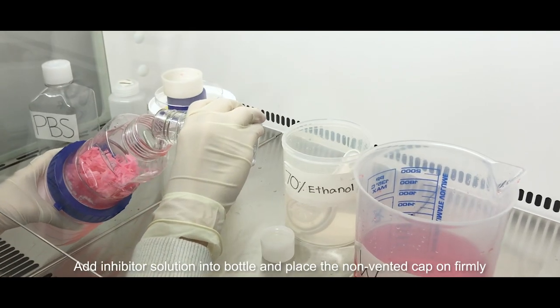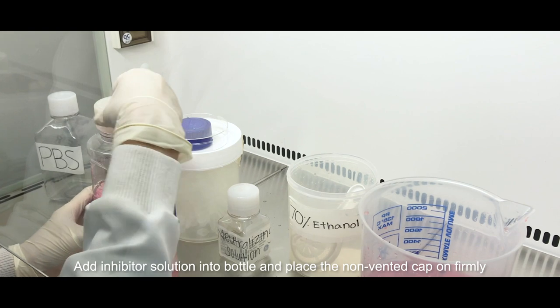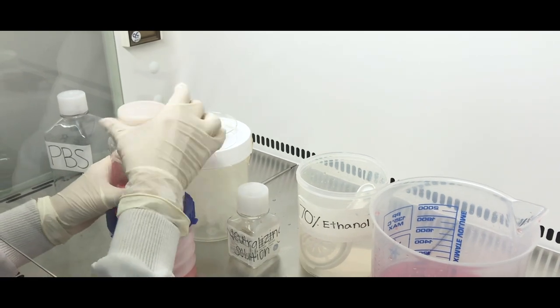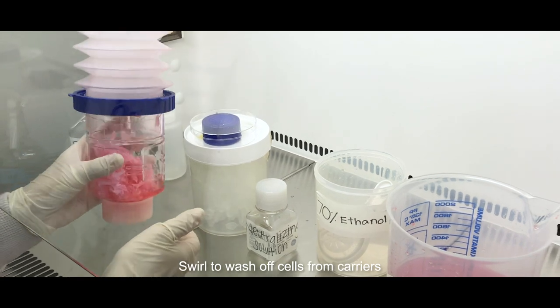Next, add inhibitor solution into the bottle and firmly cap the bottle with a white non-vented cap. Invert and swirl the bottle to wash off cells from the carriers.